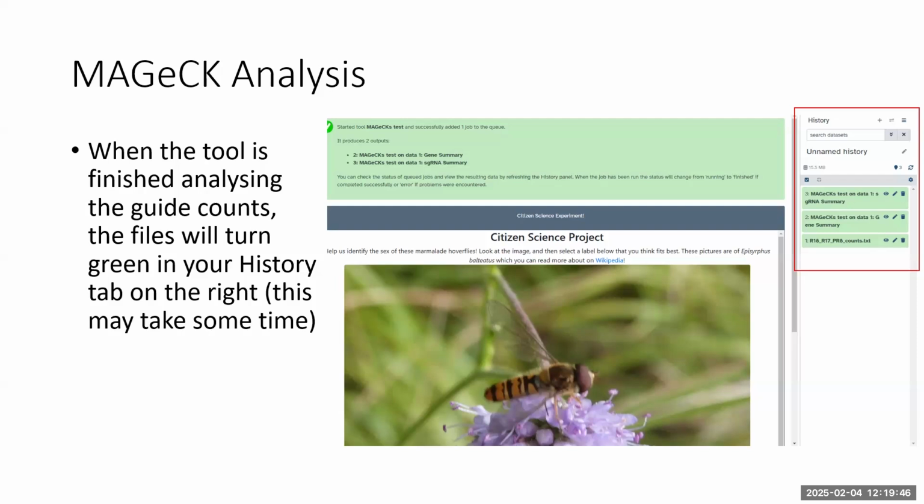So I have to admit, this was from a proper screen for chicken influenza virus, but because it was funded by a company, we had to scramble the gene names. So don't go investigating ITGA4 as an influenza dependency factor. Essentially, if this was a real screen, then this is producing guides that, when you target that gene, you're getting enrichment of those guides in the low population. It essentially means that that gene is required by influenza virus to replicate. And that's what it means with all the genes in this list.